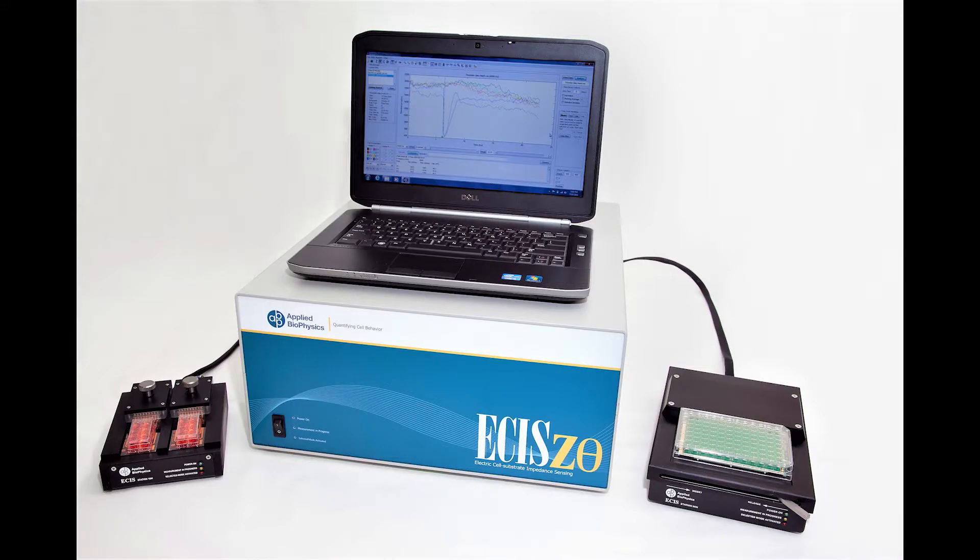These instruments connect to devices in the incubator space. On the left-hand side of each instrument is a 16-well holder that accepts two of the eight well slides. And on the right-hand side of each instrument, a 96-well holder for monitoring more wells to provide higher throughput.